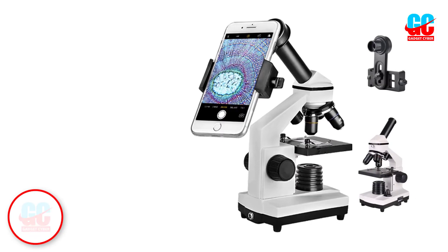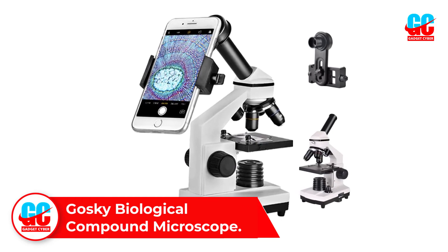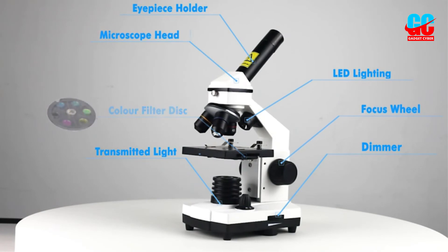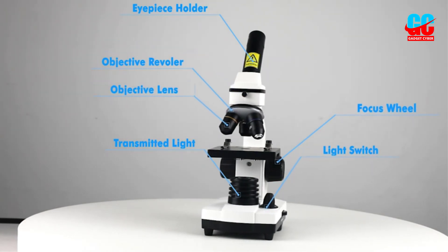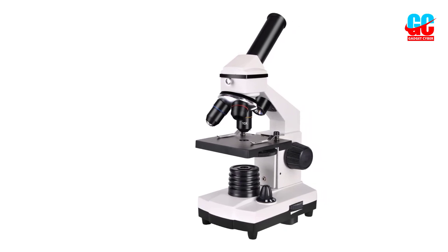Number 5: Gossky Biological Compound Microscope. Despite being more expensive than many of the similar models we tested for this list, the Gossky 1280 Biological Compound Microscope is a relatively weak offering that didn't do much to impress us. Like many similar microscopes, the Gossky offers three switchable objective lenses with a range of magnification levels, and six different magnification settings to choose from.